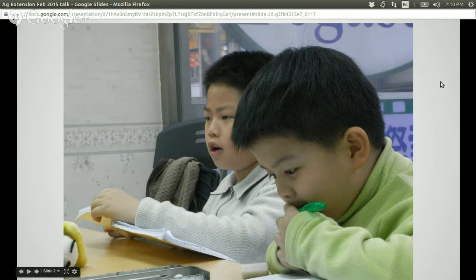So what are we trying to do? What are our goals? Well, one of the outcomes we'd like to see is a 10 or 15-year-old kid ask an interesting question on the PhotosynQ platform and have people all around the world help him or her answer that question. So that's sort of democratization of science. We don't just want professors to be able to ask interesting questions, but we want everyone to be able to ask those questions. And we want the quality of the question to dictate how many people get involved and to what extent. So this is a non-hierarchical platform.